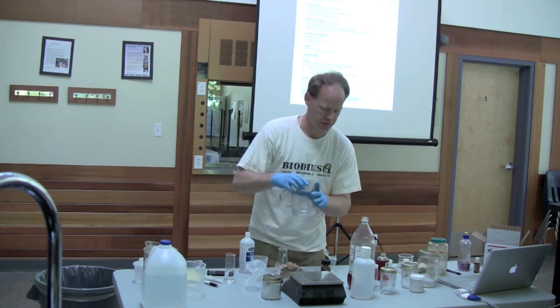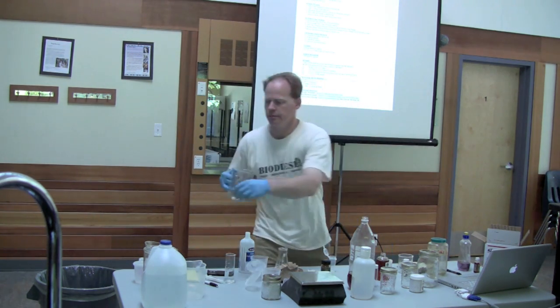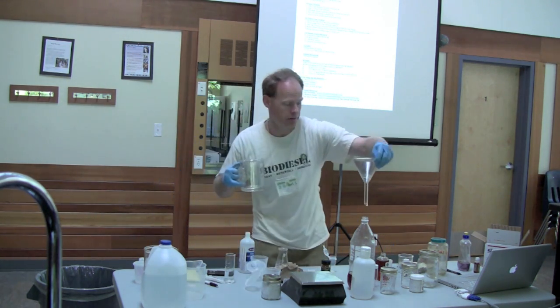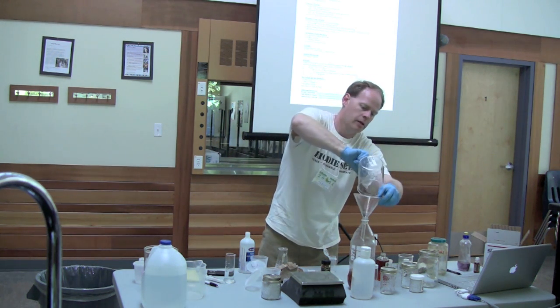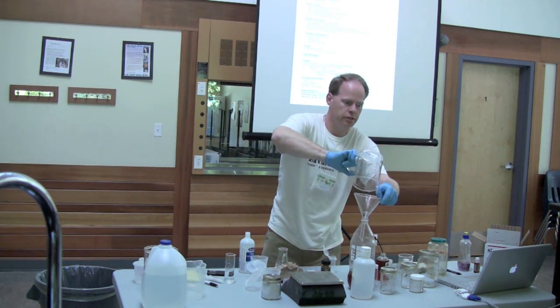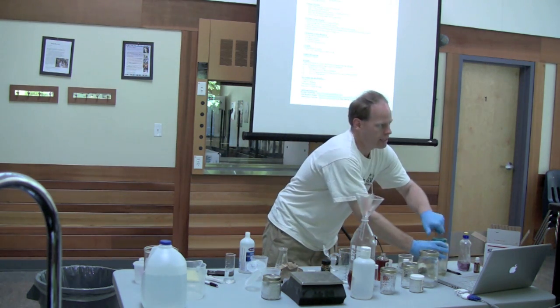I say that's dissolved enough. What do you guys think for this demo? We got started a little bit later, so you know what? Y'all can help me shake that up while we go through it. Normally, all of this should be dissolved. You can see that not all of it is. So I'm going to kick it a little bit.